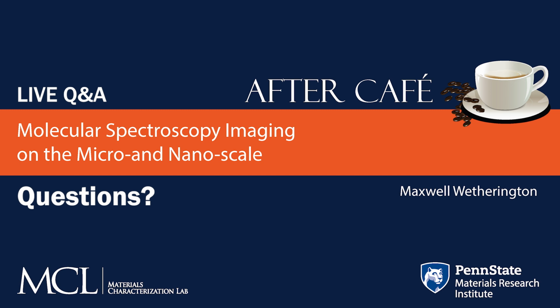There are some caveats to that. I can get into that, but that's a little bit more in the weeds. Simply speaking, you can compare the spectral response we see with Nano-IR to the measurements we see with far-field IR.